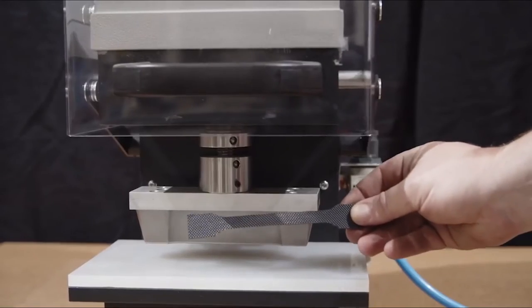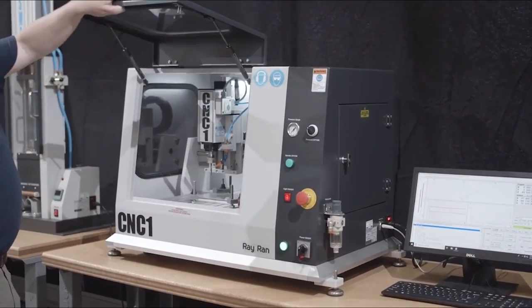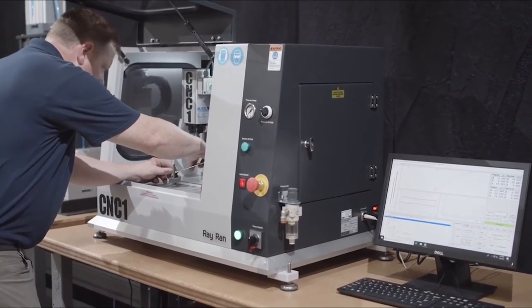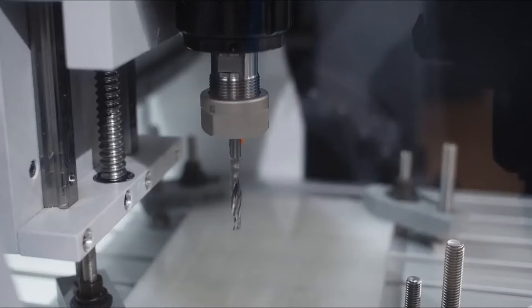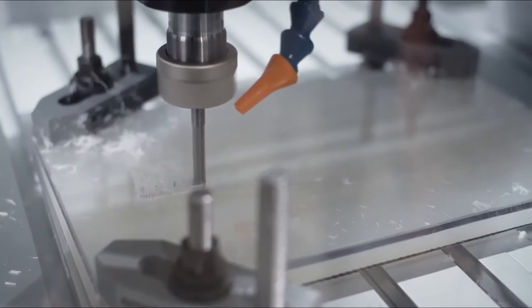Also on display at our demonstration lab is the more advanced CNC1 and CNC2 sample profile cutting machines. The 3-axis rapid-prototyping CNC1 vertical milling machine is ideal for cutting hard, dense polymer sheets and laminates up to 40 millimeters thick.